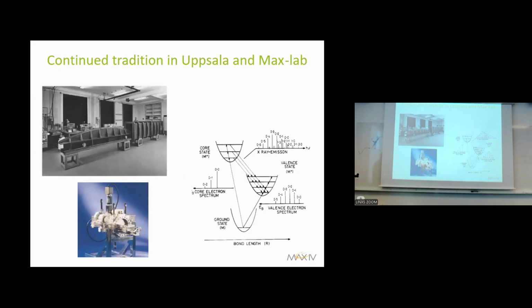Here is a picture of a very early X-ray spectrometer. You had the focal condition made physically in metal, and then you just put your grating, your electron beam source, and your photoplate along this curved surface. You pumped down, started the E-beam, and went away for a while, and you came back. You developed the photoplate, found you were slightly out of focus, and then moved the photoplate. A typical acquisition time for a spectrum then was around 3 months, if I understand correctly. So it took quite some time.